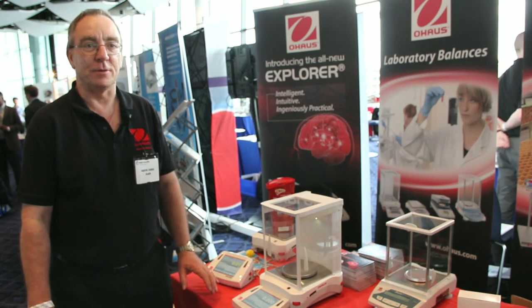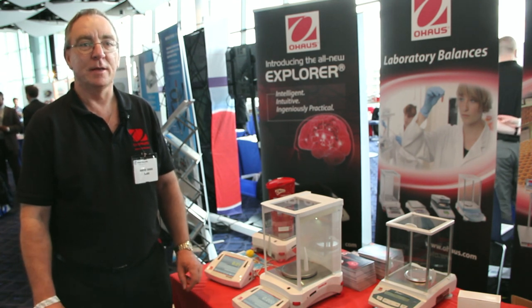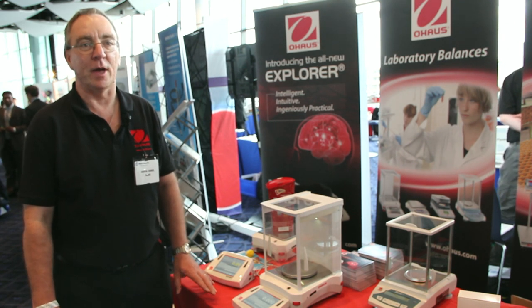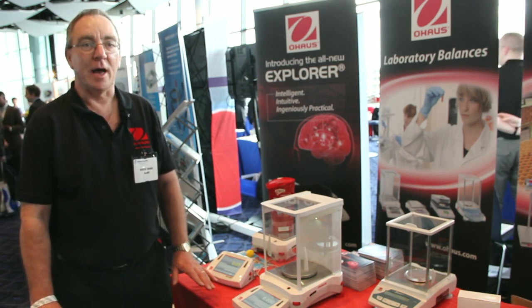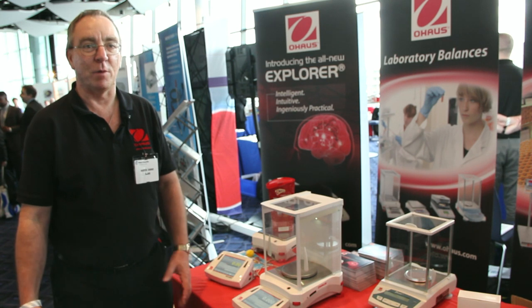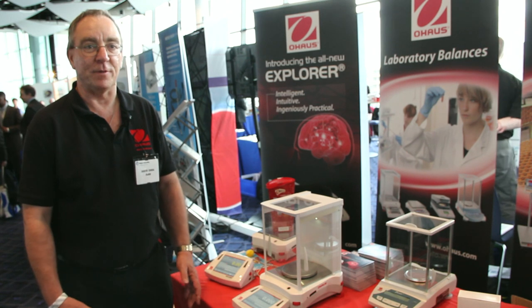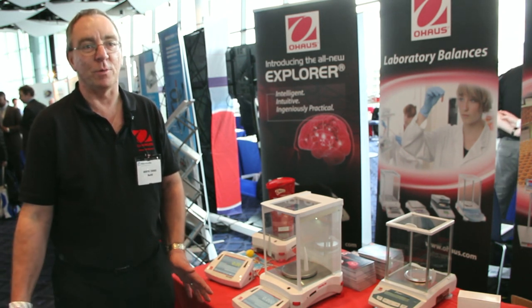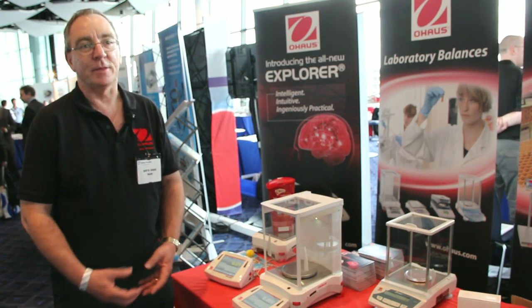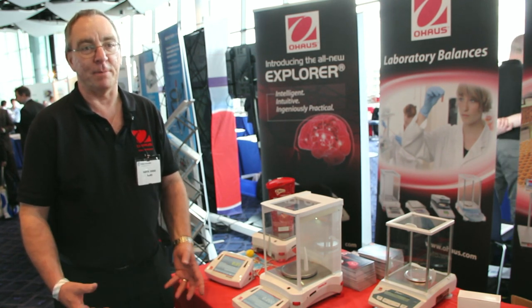Applications within the balance include counting, density weighing, as well as basic weighing. In addition to that, the balance enables the owner to set up a number of different users, allowing the balance to be made specific for their applications. For example, one user doing density weighing can have the balance set up specifically for him, while another user doing straightforward weighing can be set up directly for him. On top of that there are security features which enable you to lock the balance so that people can't tamper with the settings.